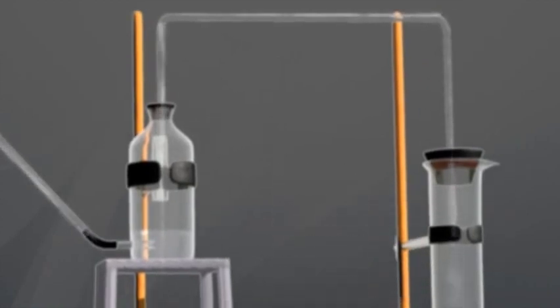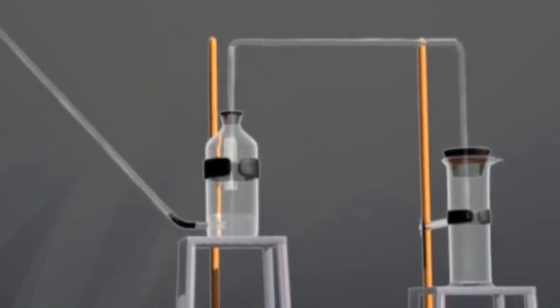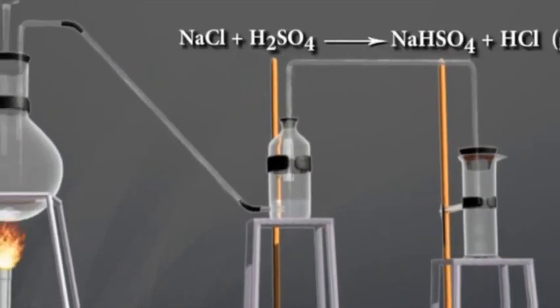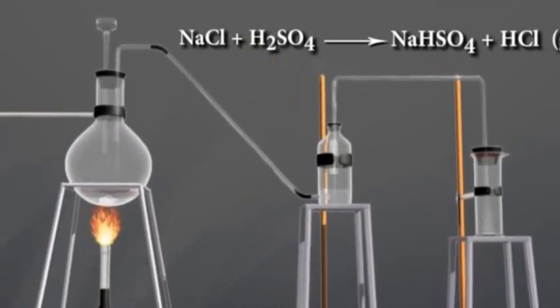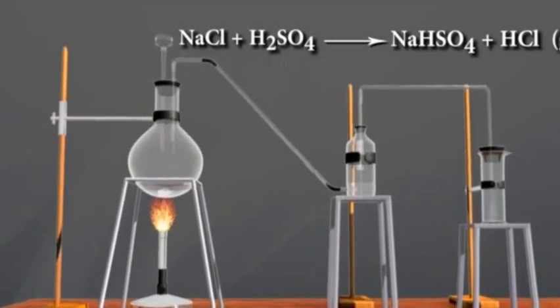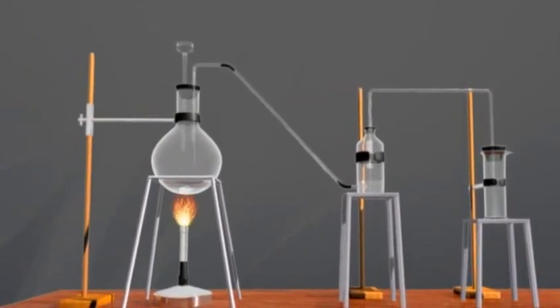See reactions take place in the experiment. NaCl plus H2SO4 is heated at 200 degrees Celsius, it gives NaHSO4 plus HCl gas. This reaction goes continuously by evolution of HCl gas and it can occur up to the stage of formation of sodium sulfate.